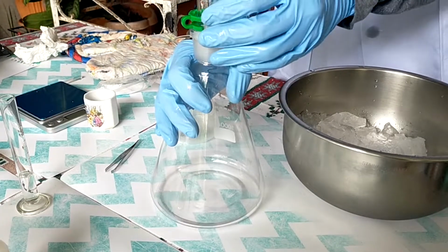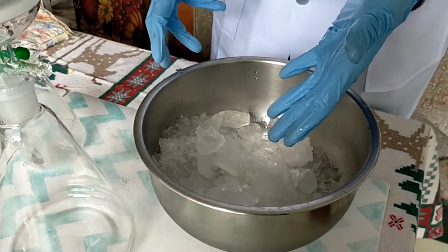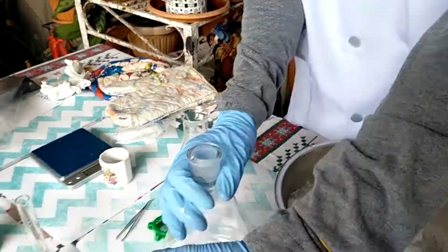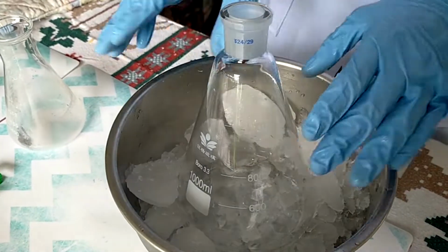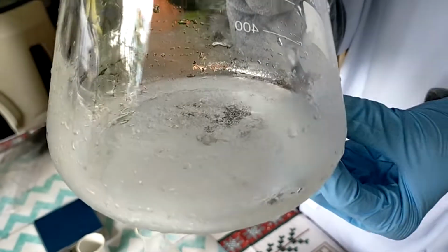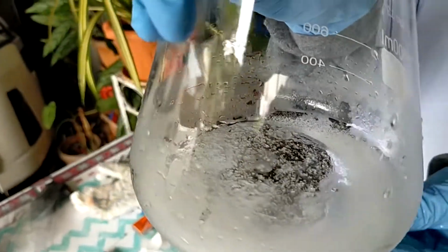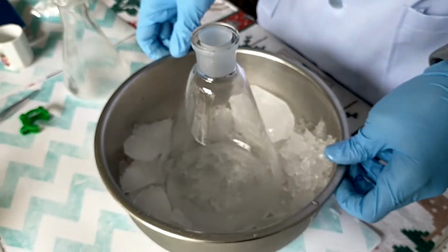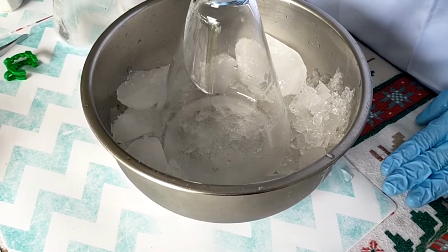we assume that the filtrate contains our dissolved naphthalene, so we will subject it into an ice bath in the hopes that we will recrystallize our naphthalene. Let's take this off. Now we will wait for a while until our naphthalene crystallizes. Okay, so it's still not finished, but you see here some cloud formation, meaning that our naphthalene is slowly recrystallizing. We will still let it sit here and wait some further time until it recrystallizes fully.